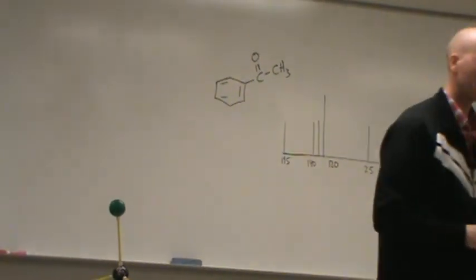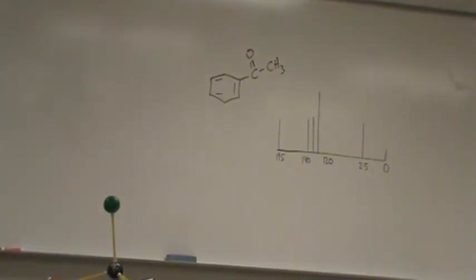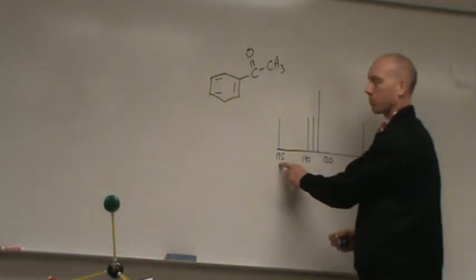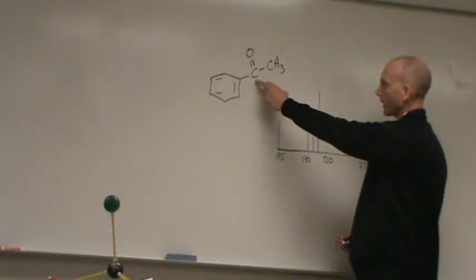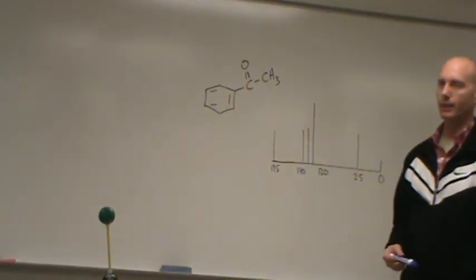So there's a rough sketch. Okay, let's figure out what's going on here. So this 195 peak, that's obviously what? A carbonyl carbon. Okay, always stands out down there.